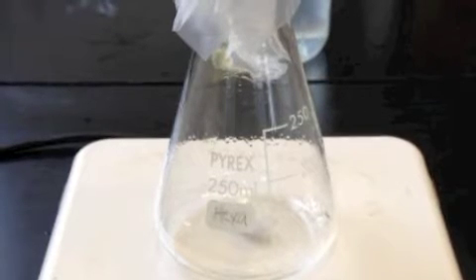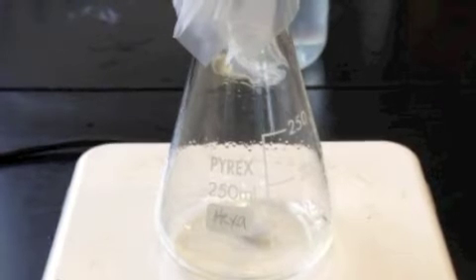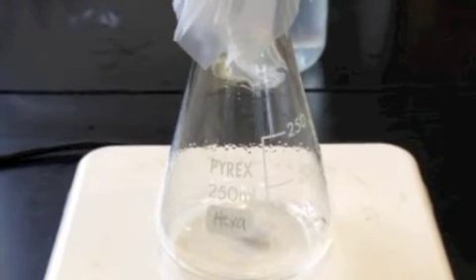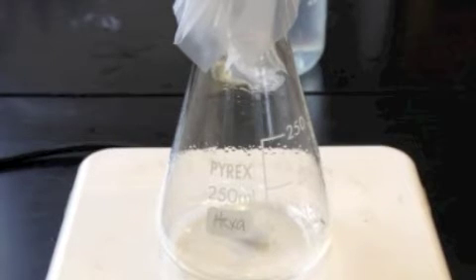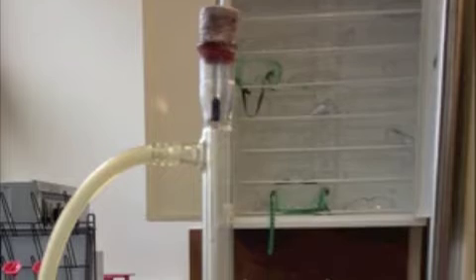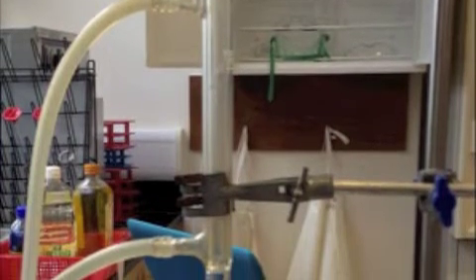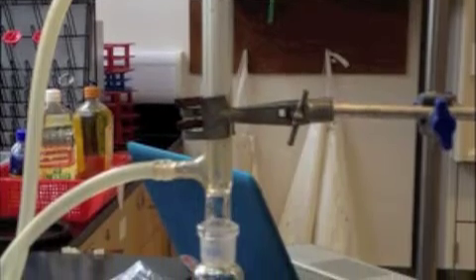Speed 3 was chosen for the magnetic stirring bar, as greater speeds caused the solution to be splattered on the sides of the flask, removing some of the reactant from the reaction. 3 minutes was used as the time allowed for the reaction to occur, as we found that the solutions could react fully in around that time.